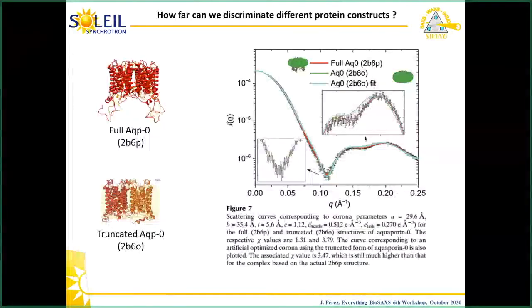And if you don't have the good protein model, if the protein part of the model that you put in Memprot is not the correct one, well, you might not end up with a good fitting. So retrospectively, it means that if your fitting is not good, it is probably due to the fact that your protein model is not exactly what you have in solution.